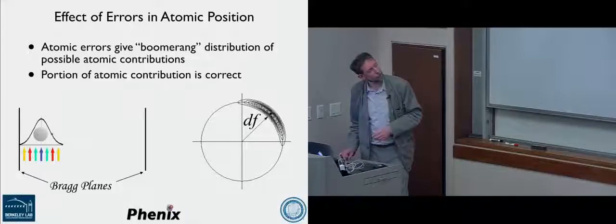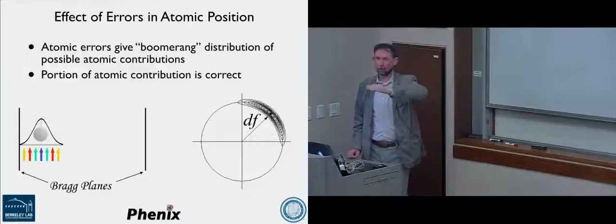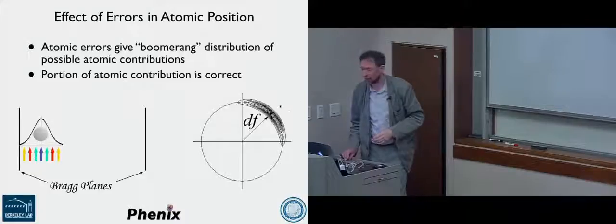If we did a Fourier transform of all of this, and we looked at the scattering from each of these positions of the atoms, left or right, we will get something like this in the complex plane in reciprocal space. The centroid position here would lead to a vector pointing here in the middle, but we would get structure factors that would point, for this one particular atom, in different phase directions. The amplitude would still be the same because there's the same number of electrons scattering, but where that scattering vector goes will be slightly different. And we'd have this boomerang type distribution here.